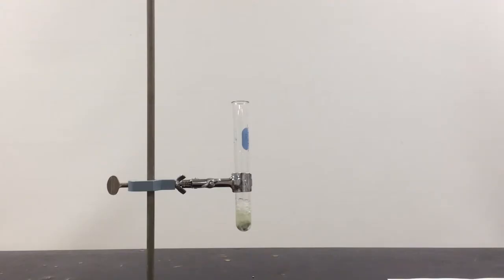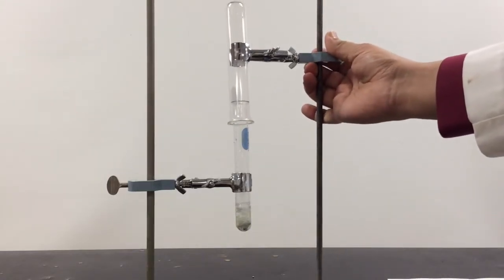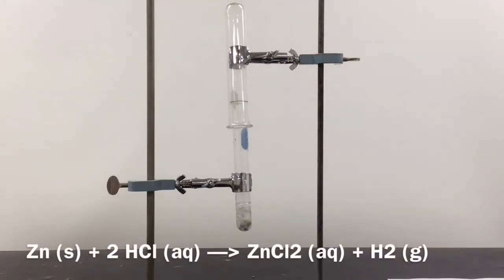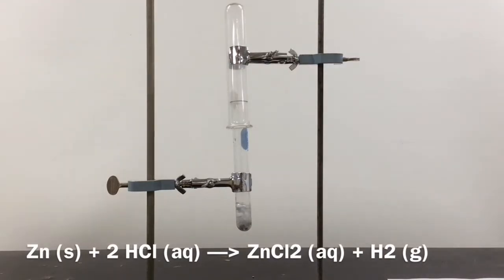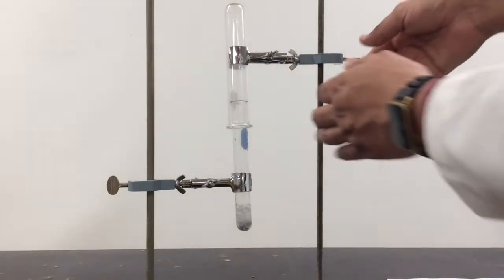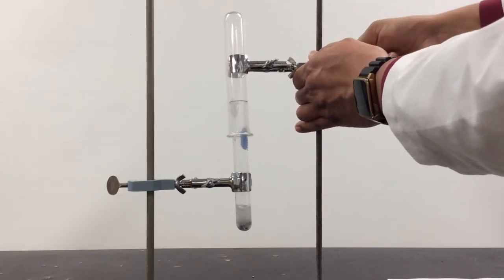Now those are bubbles of hydrogen gas. I'm making quite a bit of hydrogen gas here, so I'm going to put this other test tube on top so I can collect as much of that hydrogen gas as possible. And since hydrogen is less dense than air, most of that hydrogen should stay in the test tube.